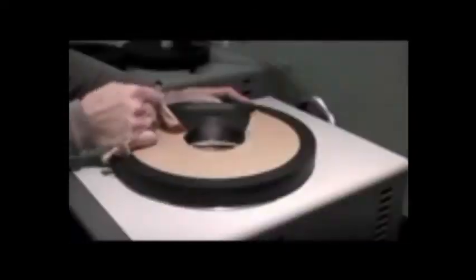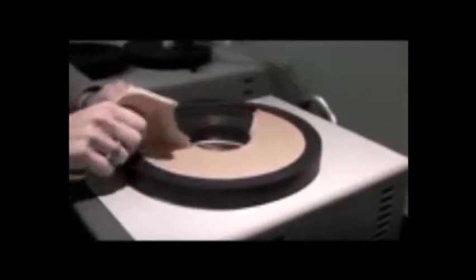Peel off the protective paper backing from the freeze dryer's chamber lid and place the lid on top of the chamber. Center the flat rubber gasket on the hole in the center of the chamber lid. Place the drying chamber or manifold over the gasket so that the holes on the drying chamber, gasket, and collector chamber lid line up.